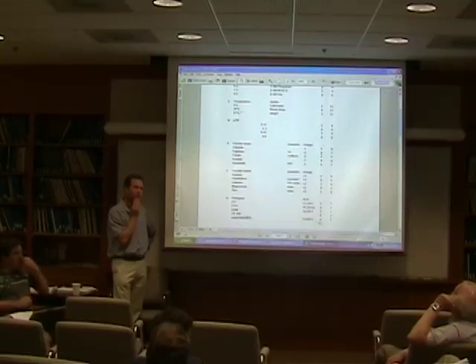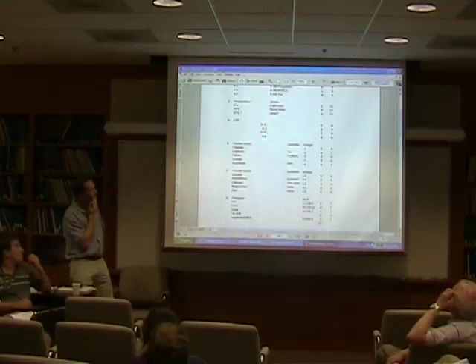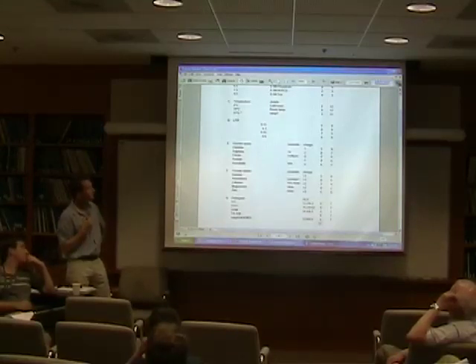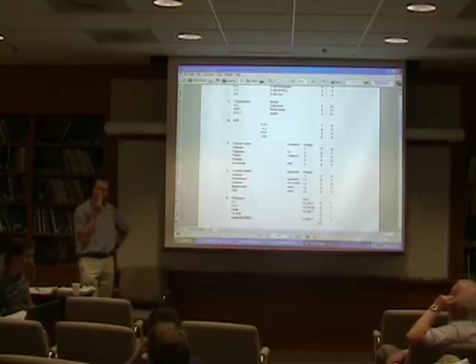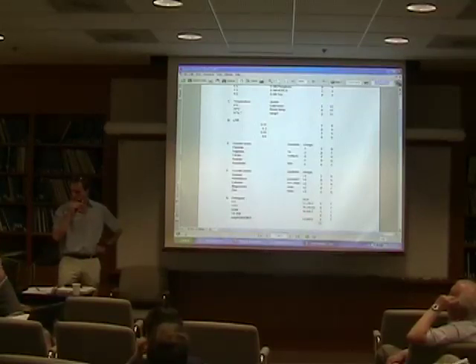Should the divalent metal ions be in the same group as the monovalent? I mean, are they? I suppose it could be. You see any reason why not? The monovalents and divalents together. Well, you could separate them, but it's hard to separate them. But then, that increases the number of screens, right? Well, not that you increase the number of screens, it's just, is there a need to have more than one salt? I would separate calcium, because these are special ones. So having zinc and calcium might be different than just having zinc.